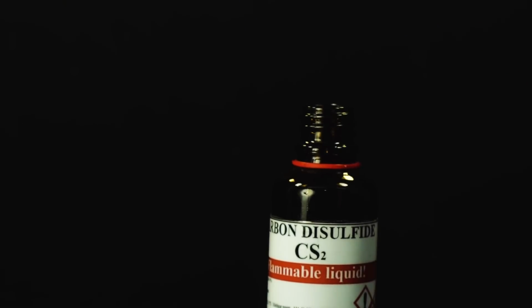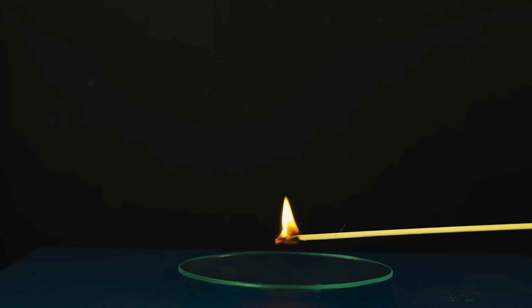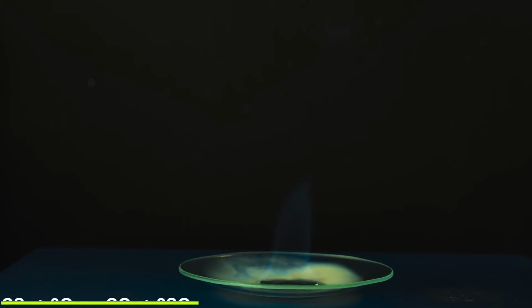Carbon disulfide is a highly toxic and extremely flammable liquid. It can flare up even while poured in a squirt in hot weather. They say that carbon disulfide's flame doesn't char paper.